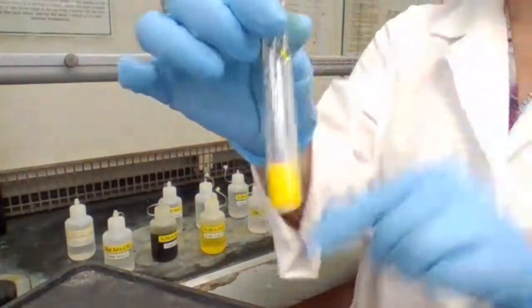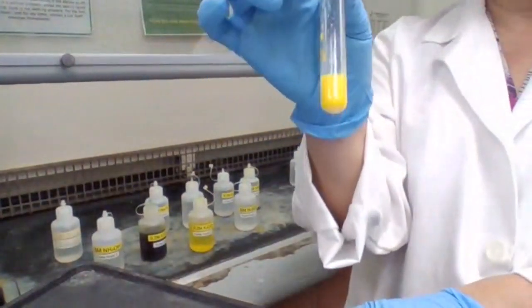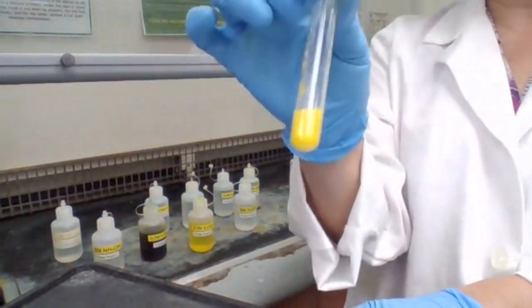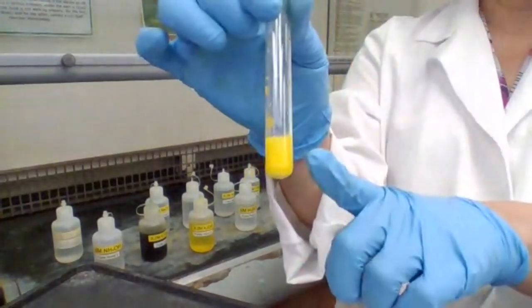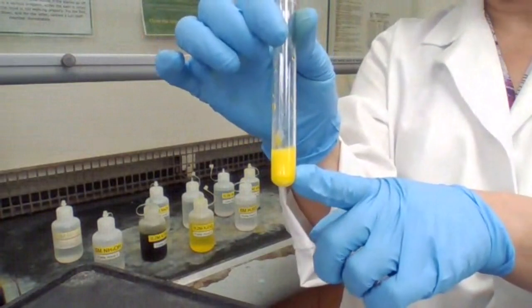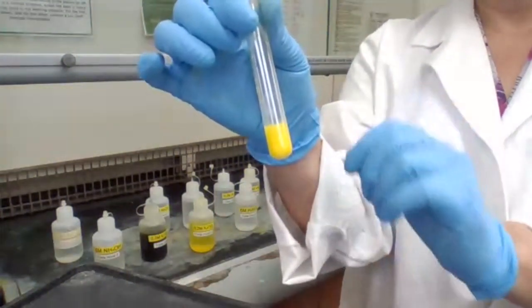A yellow color precipitate forms, and that yellow color precipitate is confirming that you do have lead ion. So for your unknown, if you see this color precipitate in part C, that means you do have lead ion.